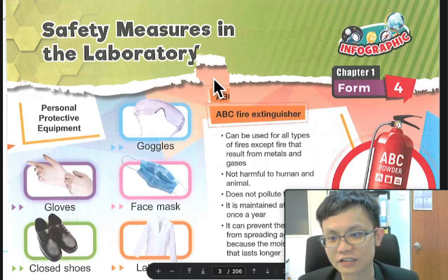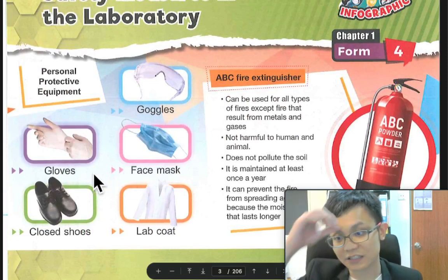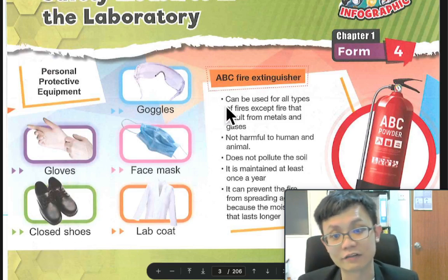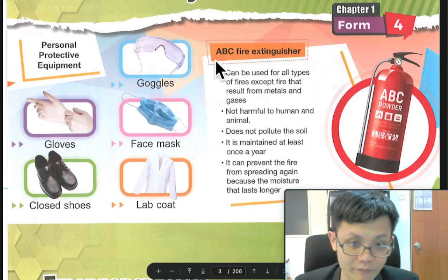Okay, safety measures. This one you know, so I'll just skip it. Goggles are a safety measure. Glove, face mask, lab coat, closed shoes. I think you guys know this already. But this one you need to memorize a bit.